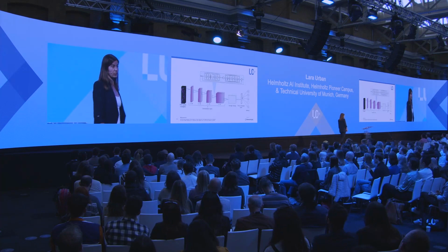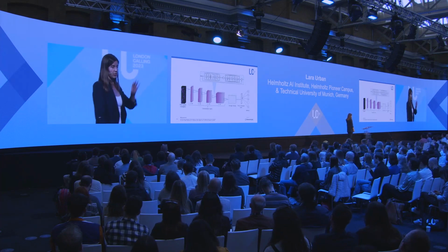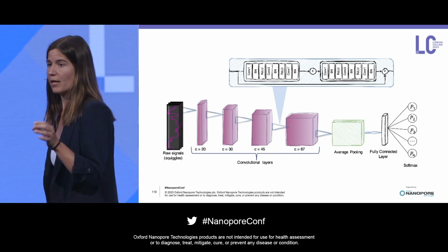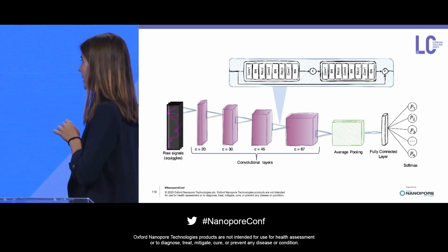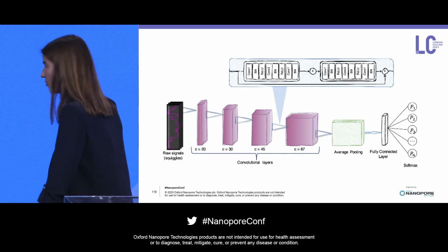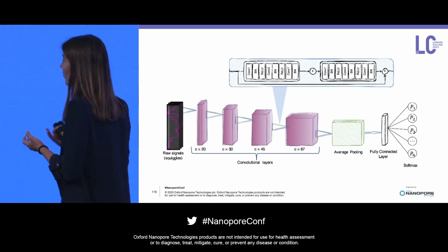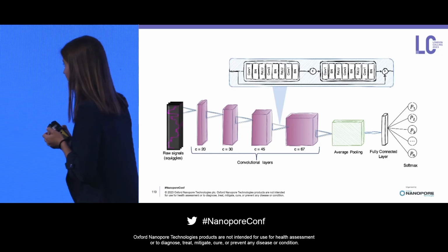So we started by just growing some E. coli and letting them die, and then nanopore sequenced both the living and the dead bacteria. We then fed this data into a residual neural network, which has been used in many other read-based classifications of squiggle data, and importantly consists of these bottleneck structures that help us with controlling for any sort of degradation while training the system.